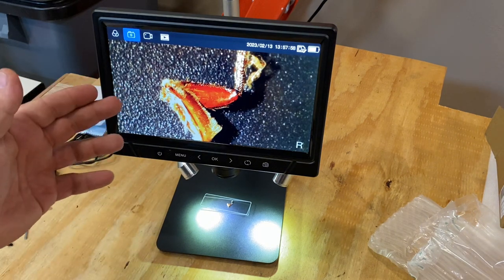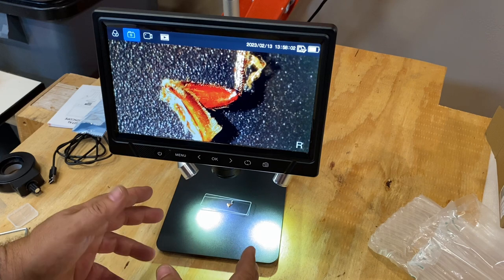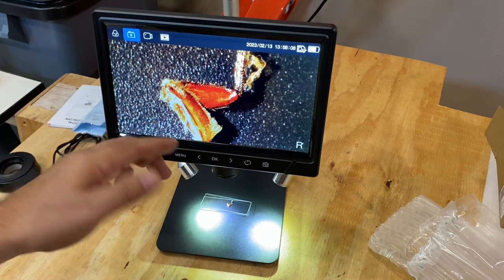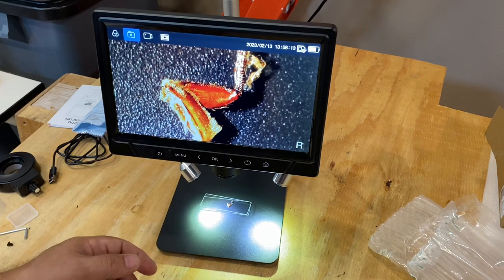You can see from the image that the slides are giving no impact to the picture — they're just completely clear and balanced so that I'm getting the right view for the issue that I want to examine with the microscope.